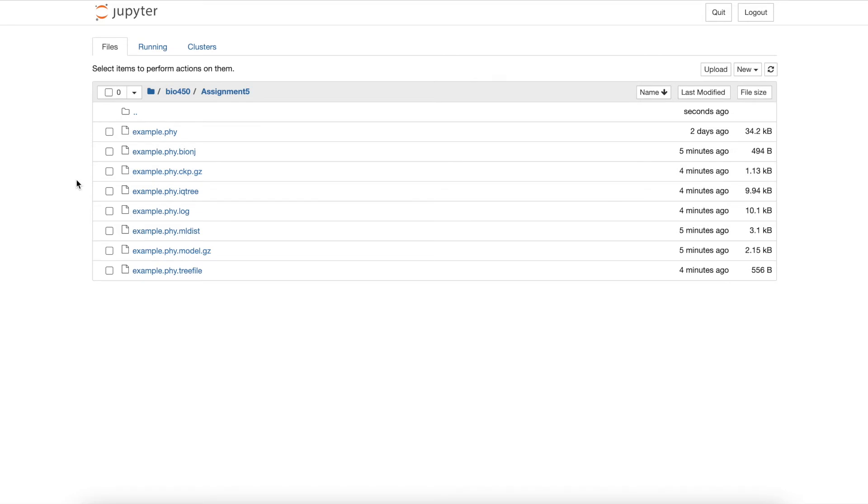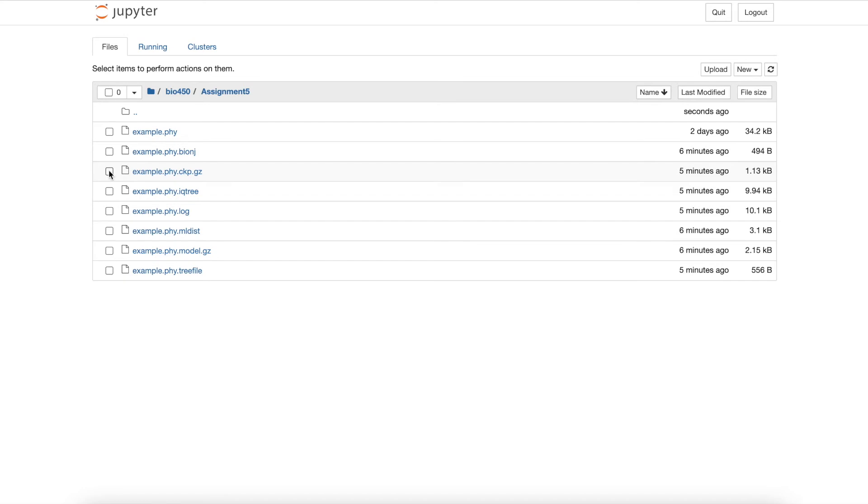This file, example.phy.ckp.gz, is a checkpoint file, which you can refer to if your run somehow got interrupted. Interruptions can occur with very large datasets that take longer than the provided time limit.